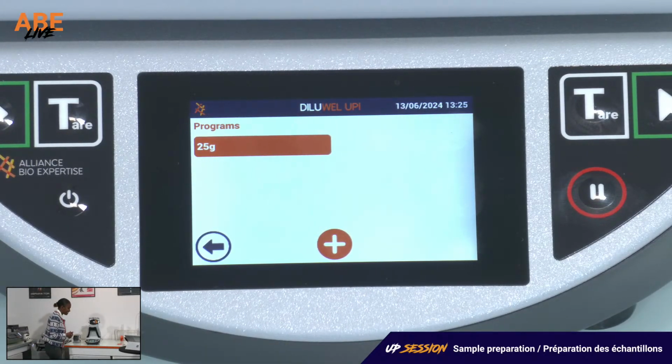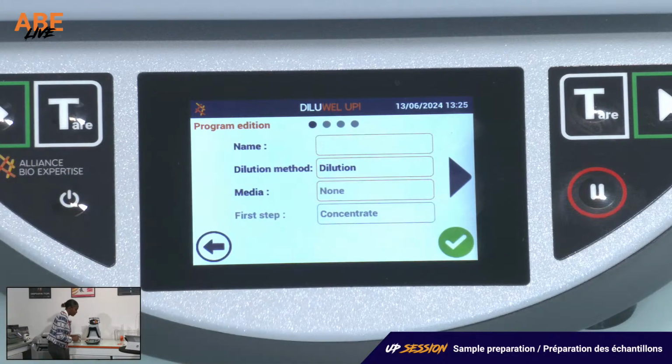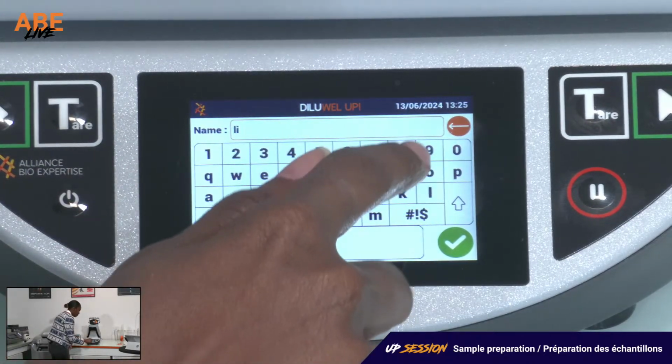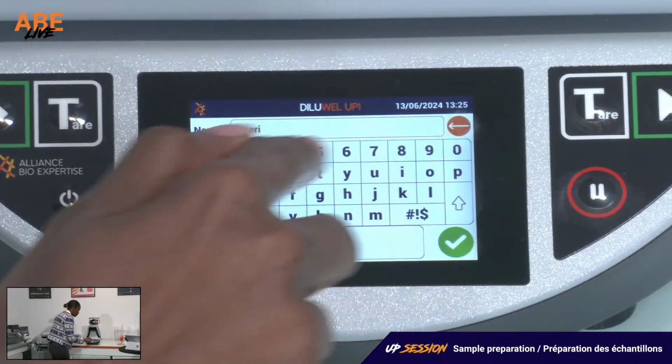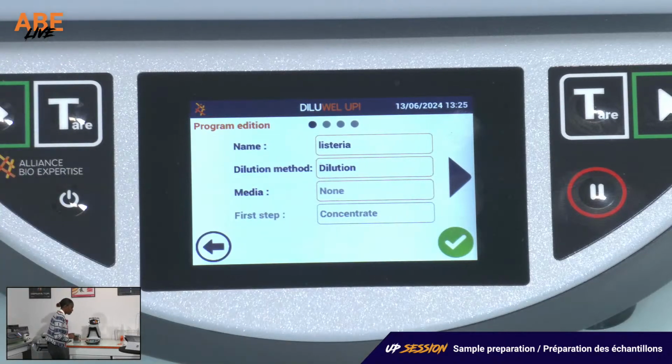Okay. So I'm in my program menu and I will create a new program. So I click on the plus. I choose the name of my program. As I told you, my program will be for listeria. So I call it listeria. And then now I can choose my dilution method.